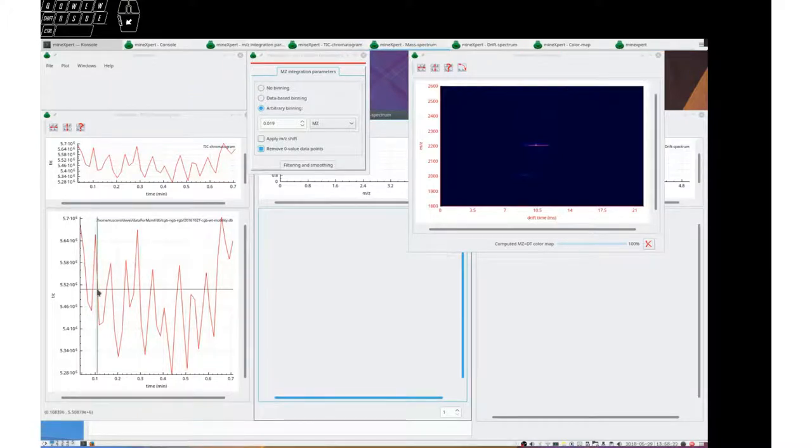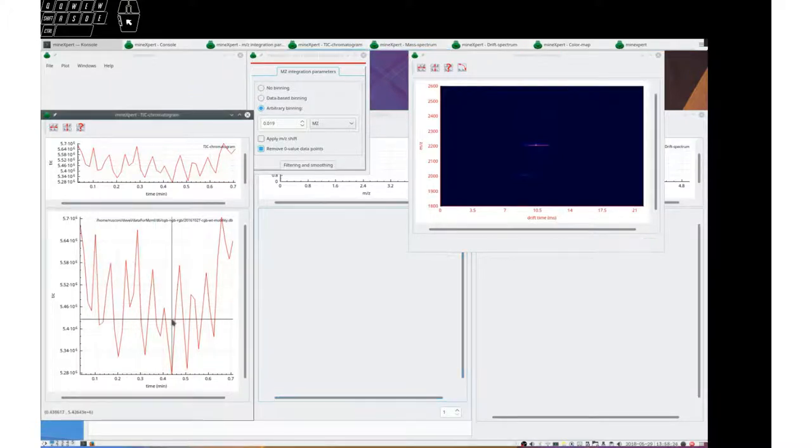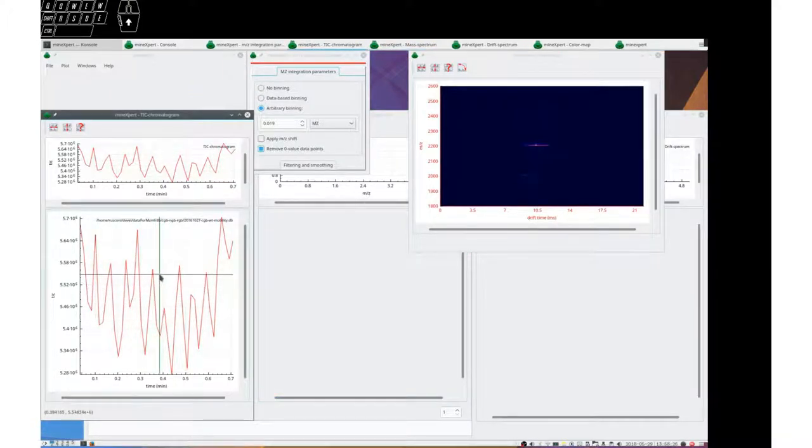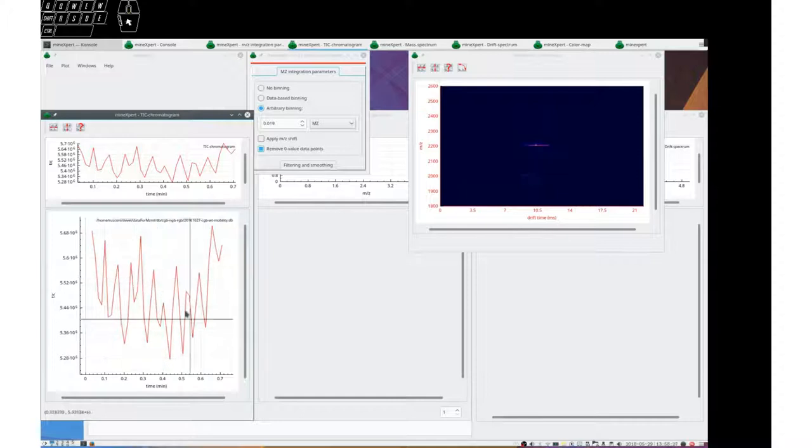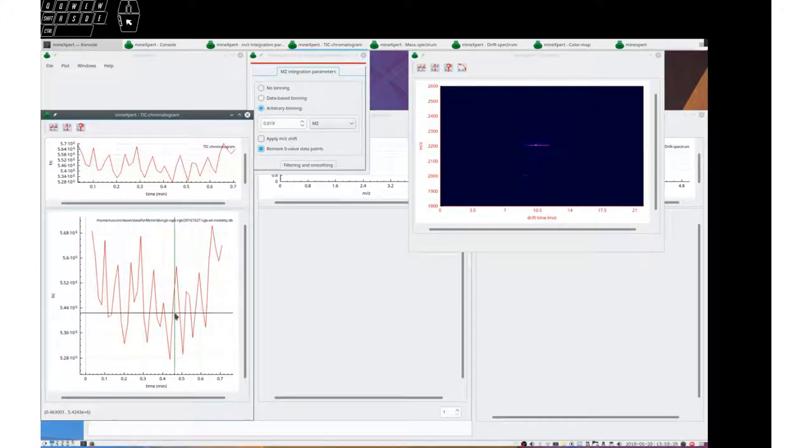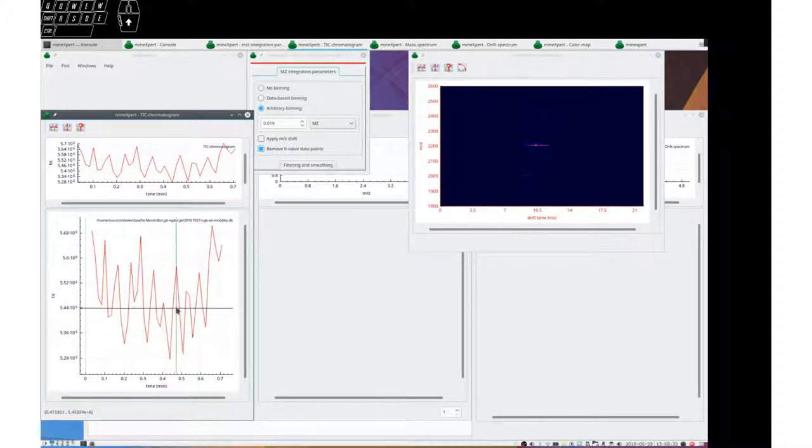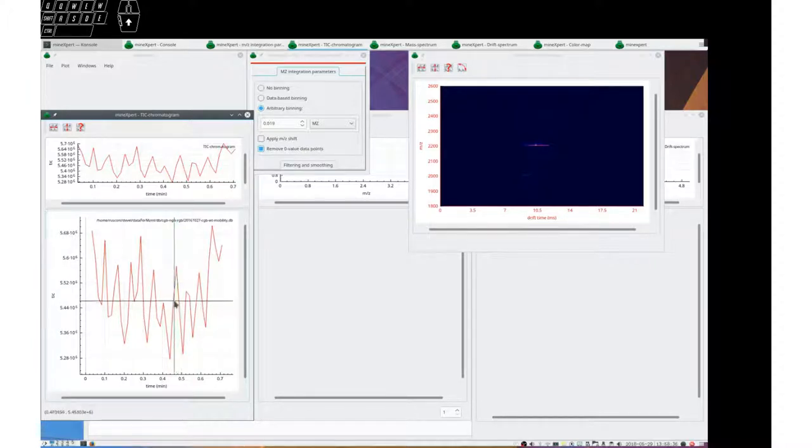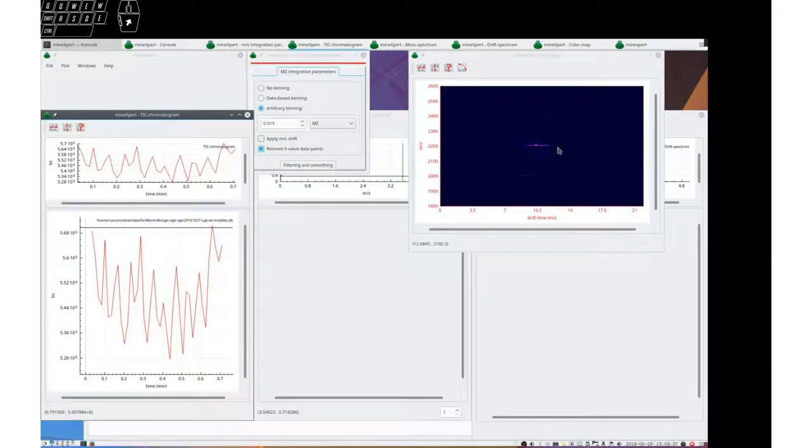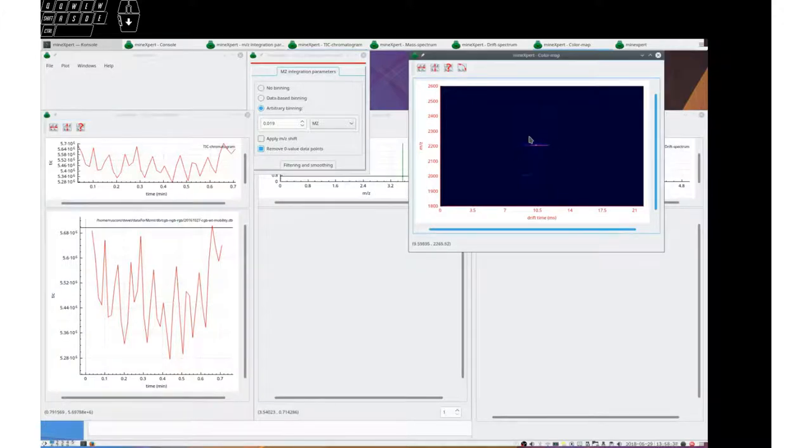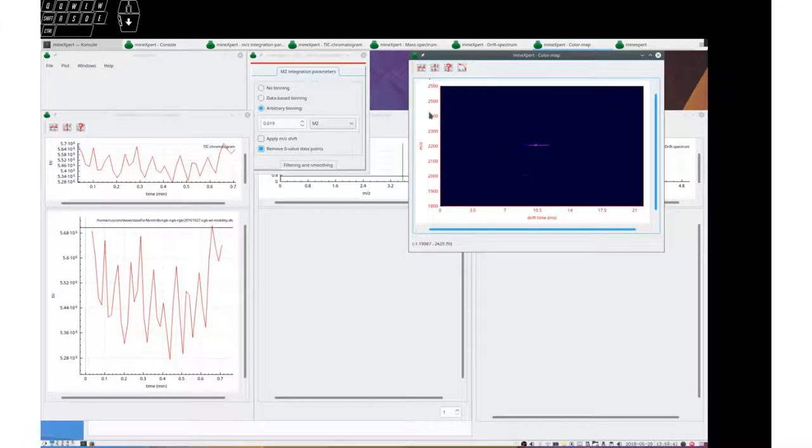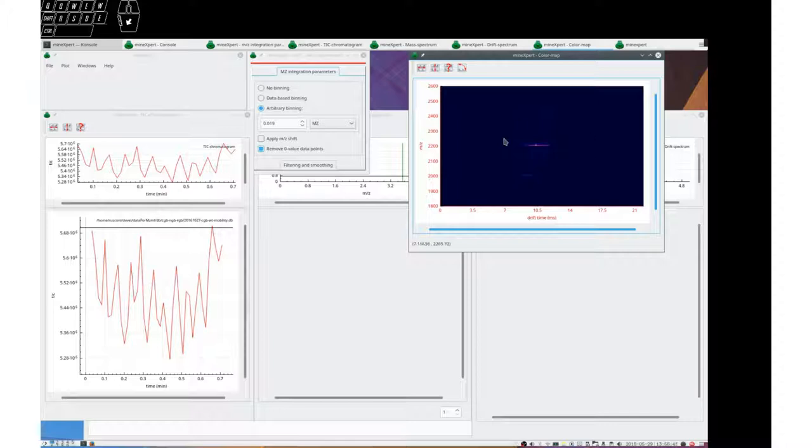We already know that when a file is loaded, a TIC chromatogram is automatically computed for that data file. If the data are from ion mobility mass spectrometry experiments, then also a color map plotting the mass spectra against their drift time and the intensity as a heat map is computed.